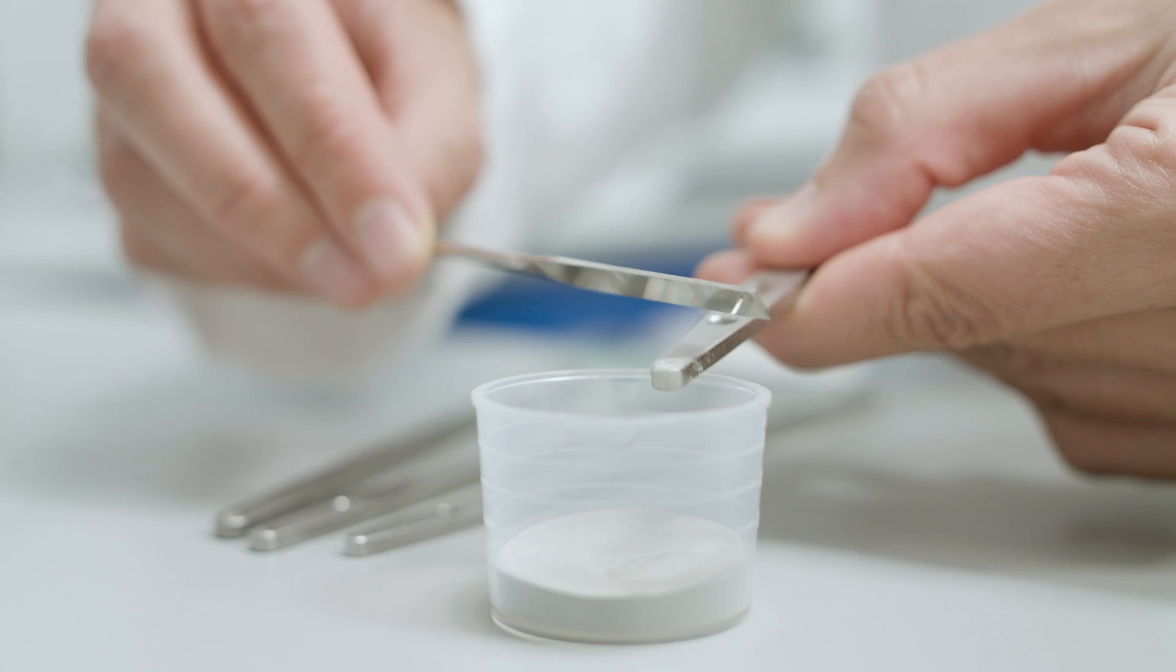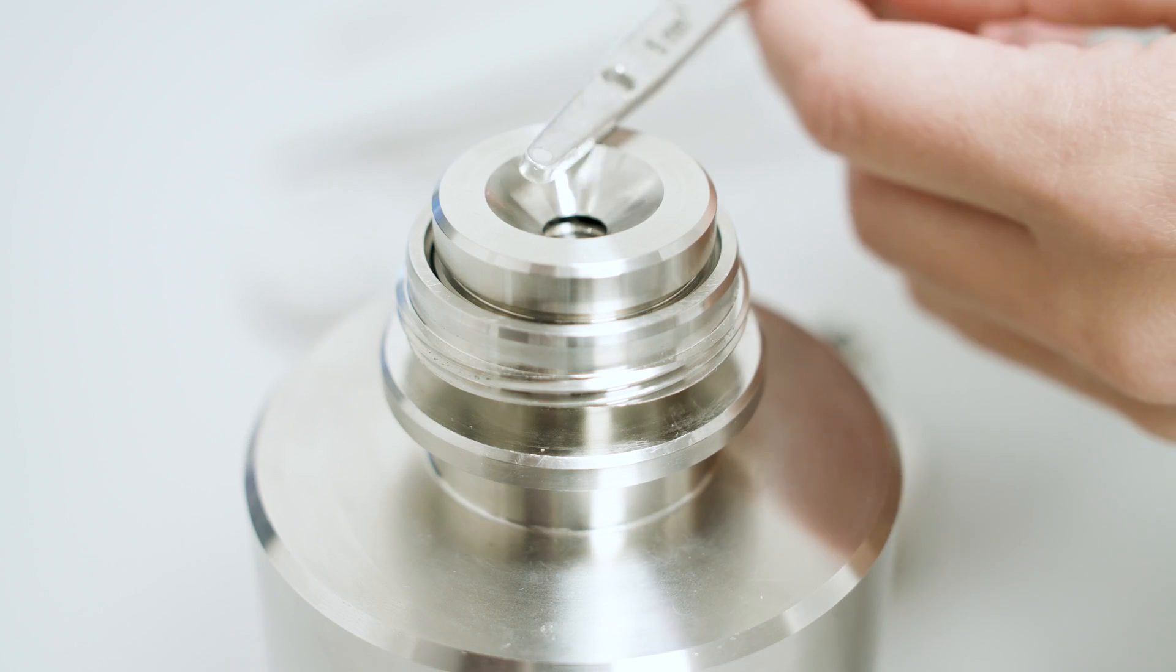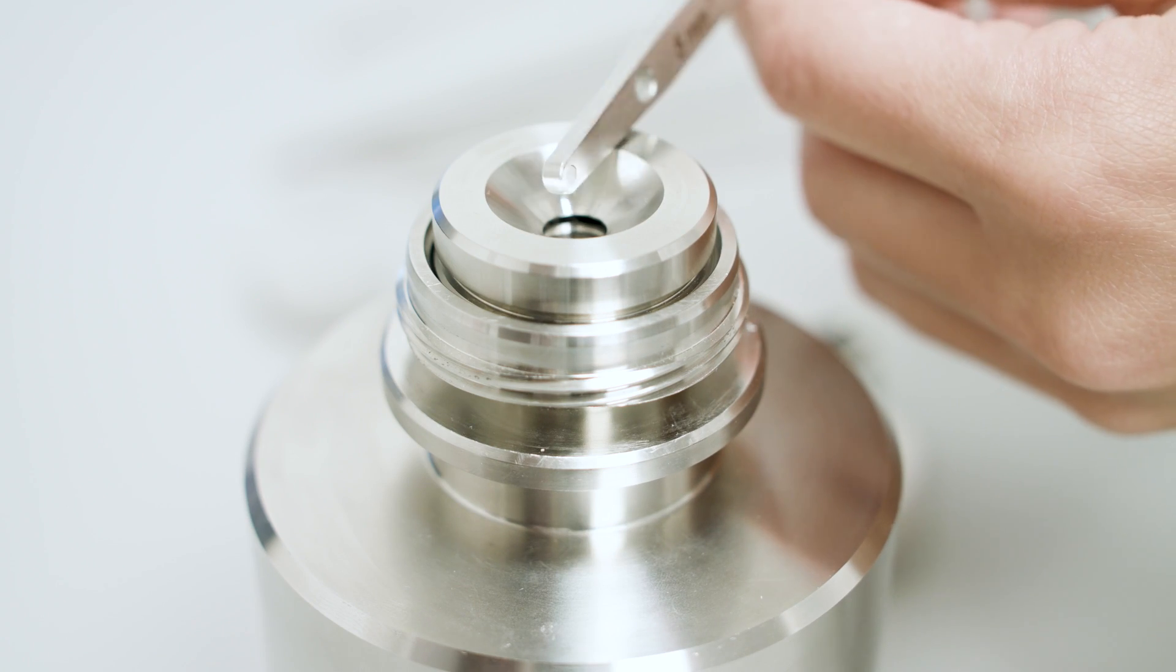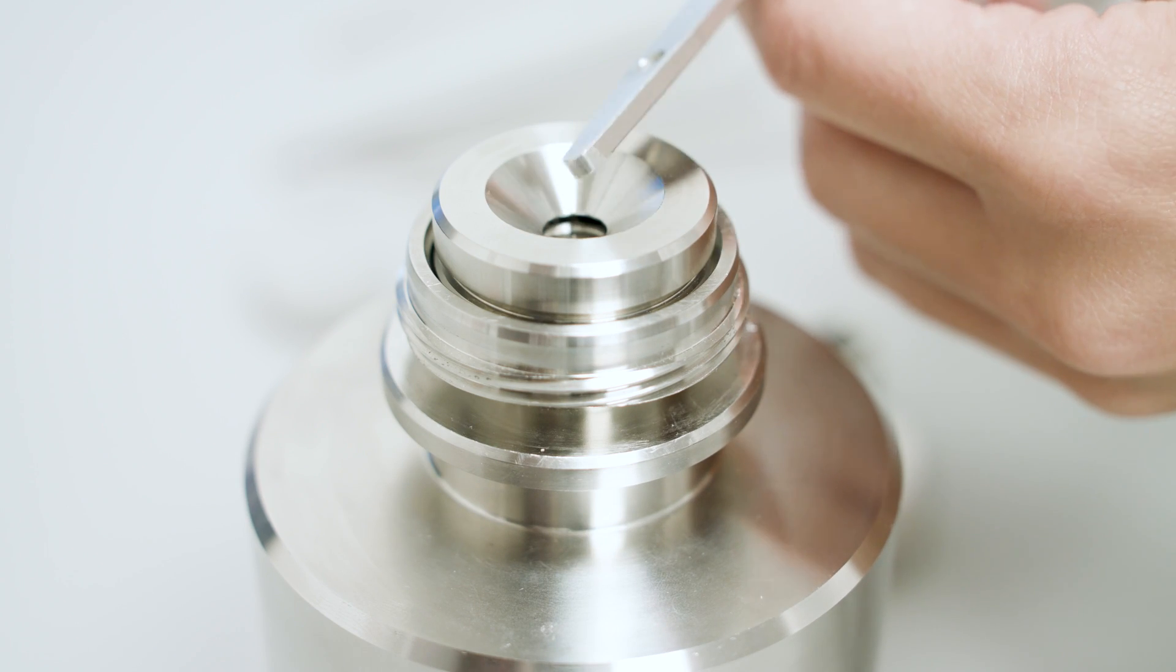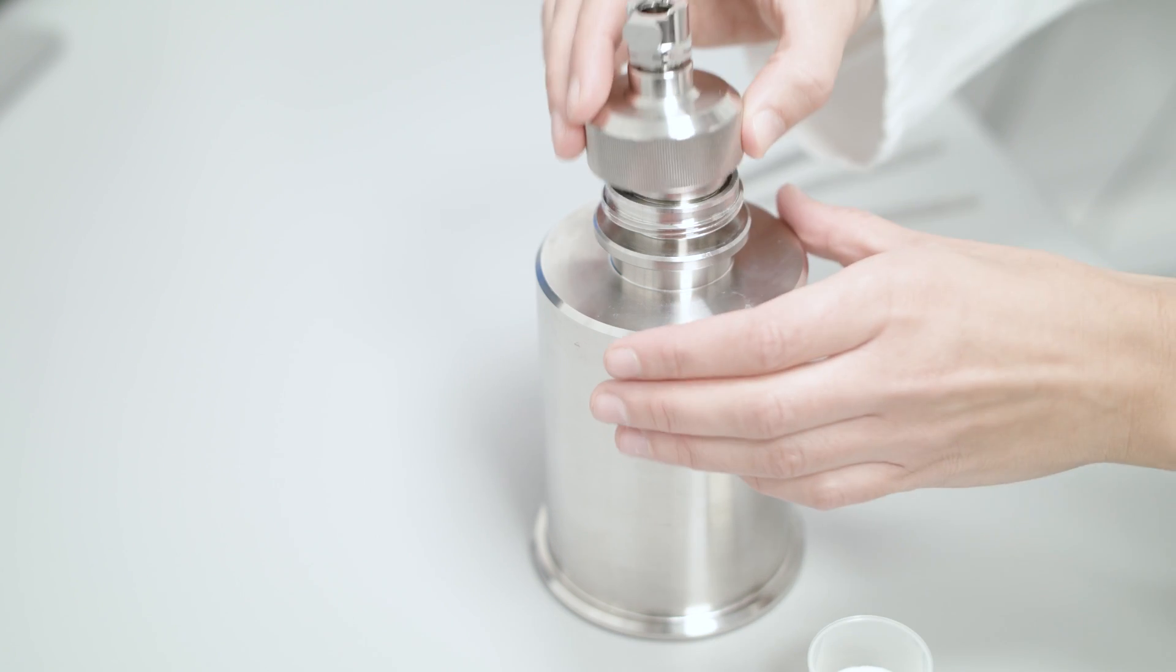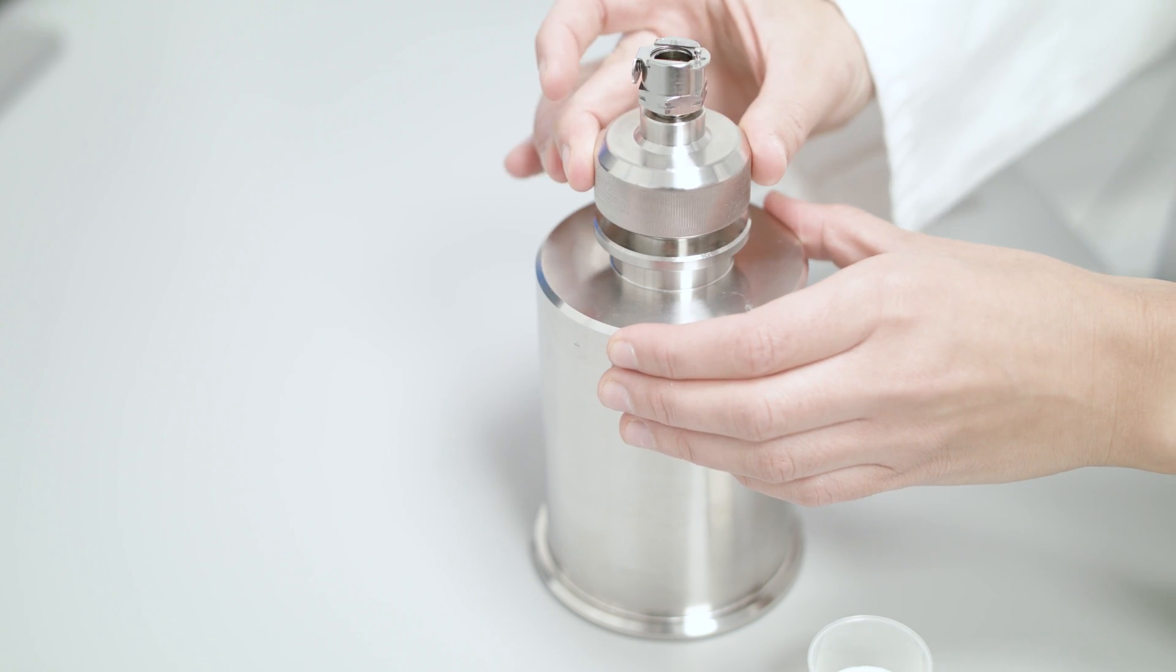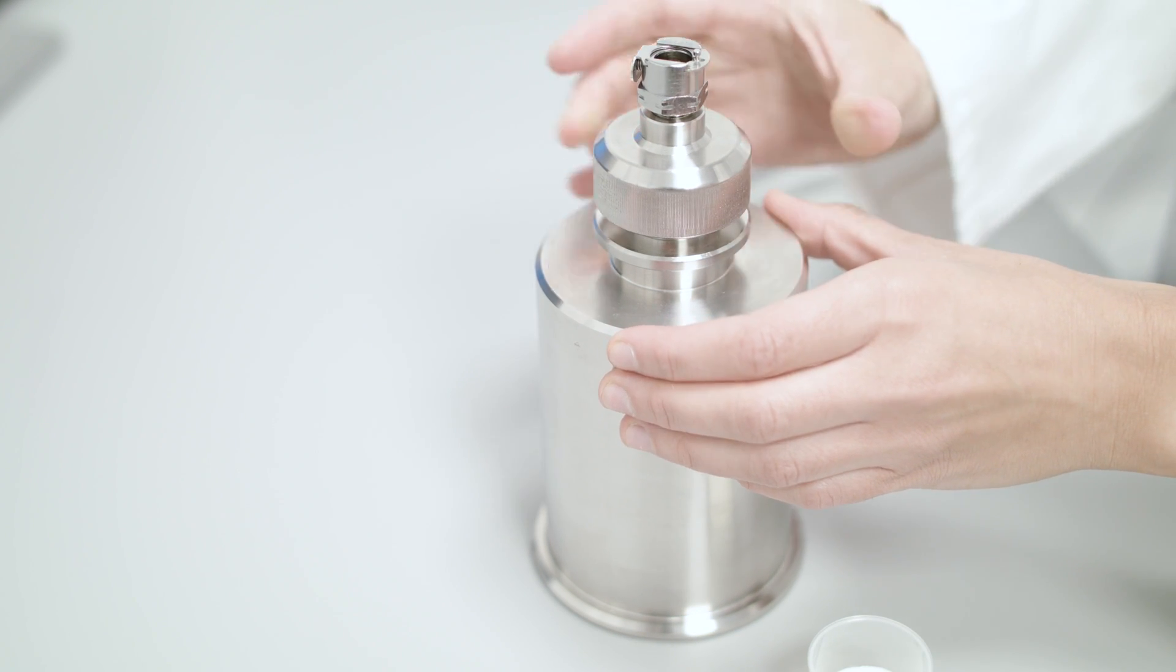For dry powder measurements, the integrated sample dispersion unit disperses dry powders under controlled conditions to give reproducible results for a wide range of materials.